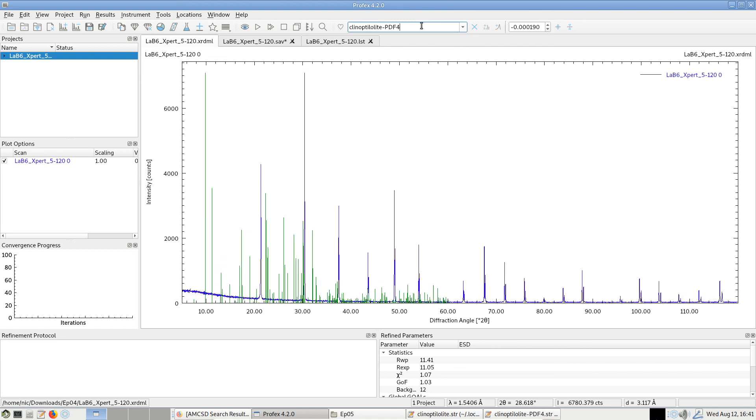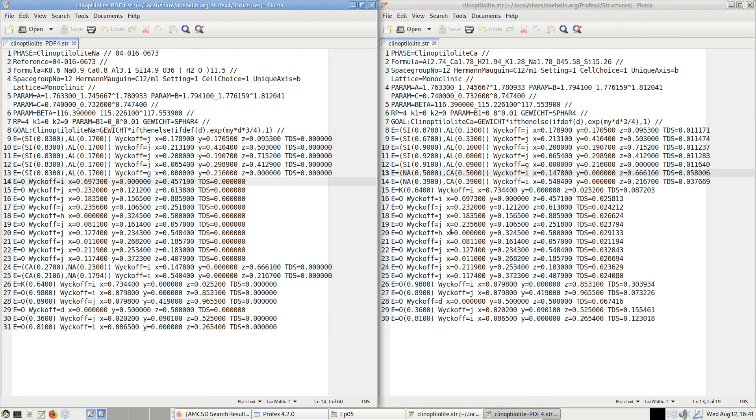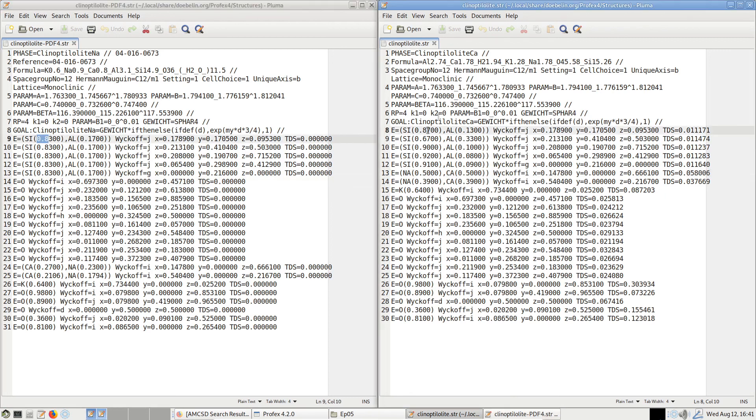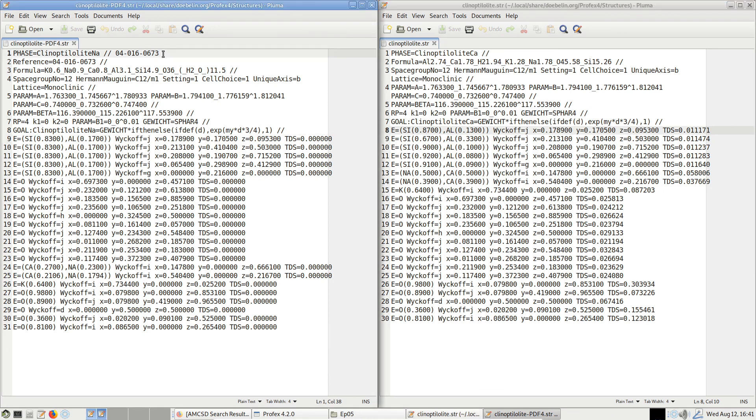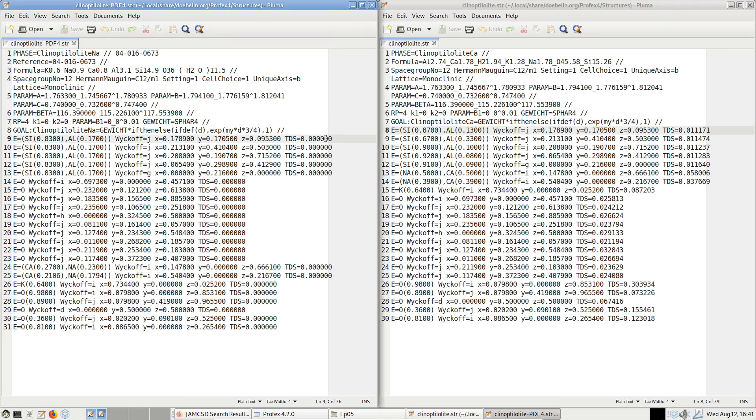So obviously, the two database records are not exactly identical. And if we look at the structure files side by side, we can in fact see that the site occupancies are different. So this is the one we got from the COD database. And this is the one from the PDF4 database. And also what we observed before, the COD record contains thermal displacement parameters. The PDF4 one does not. So they are not perfectly identical.